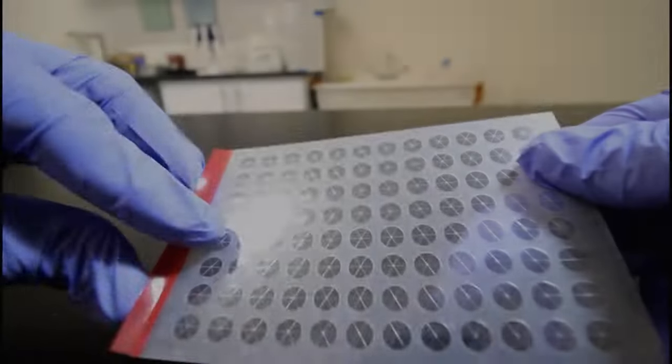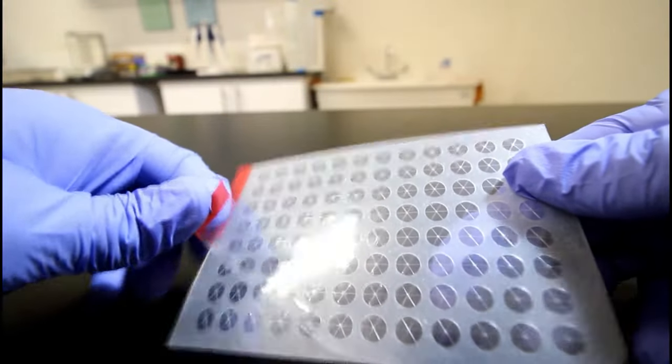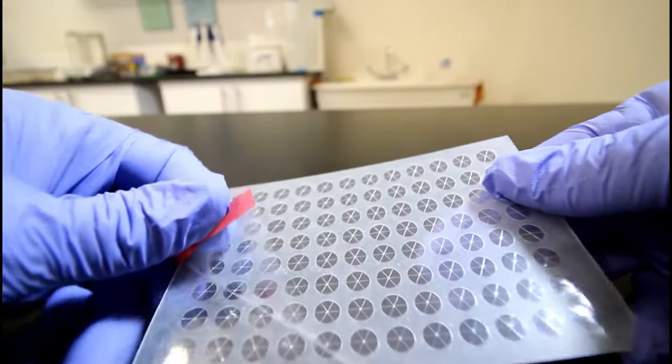Slit seals are easily placed on 96 well plates with an adhesive back, but there's no adhesive directly over the well spot.